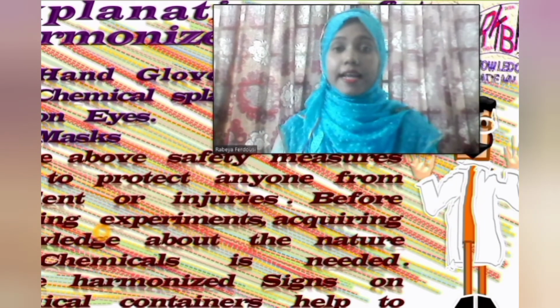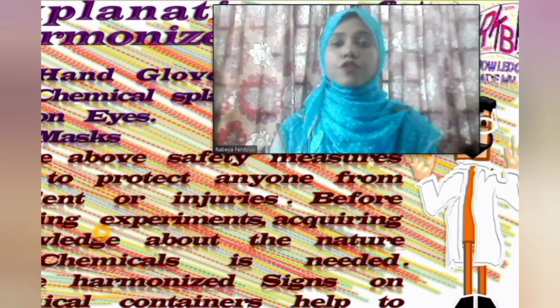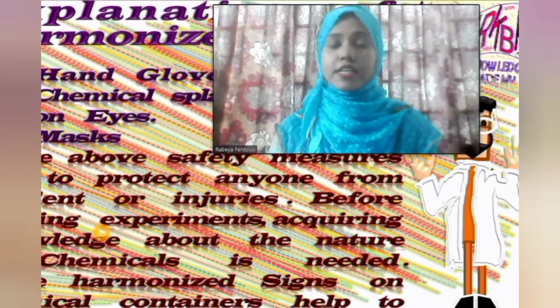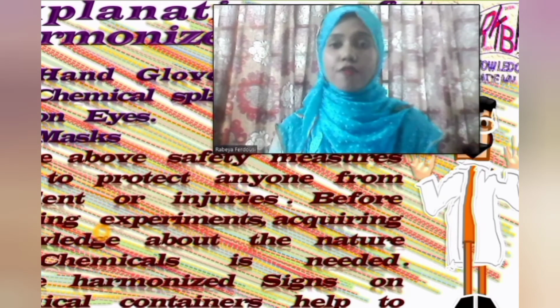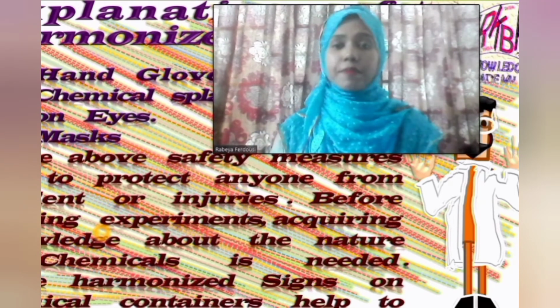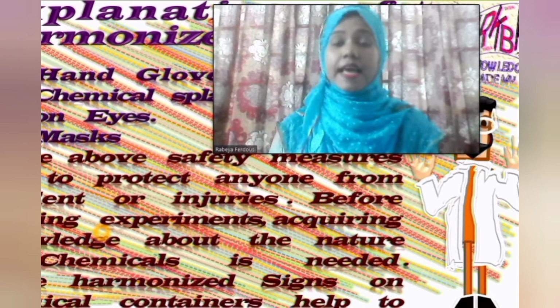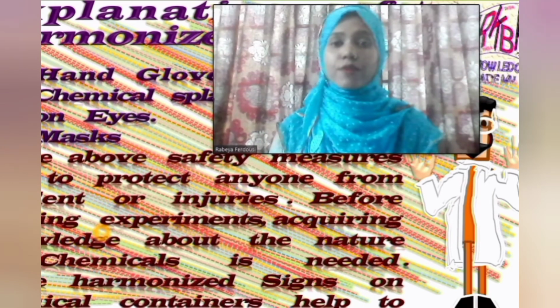However, in a chemistry laboratory, before starting any type of experimentation, it is very important to gain sufficient knowledge about the nature of chemicals. Some harmonized signs on chemical containers can help us to acquire sufficient knowledge about chemicals.